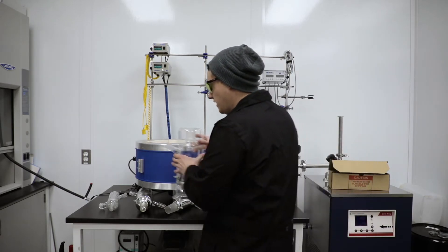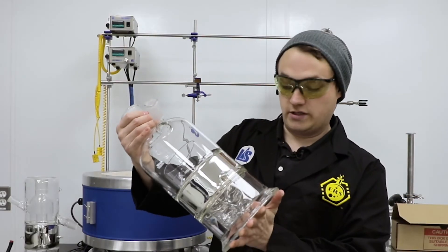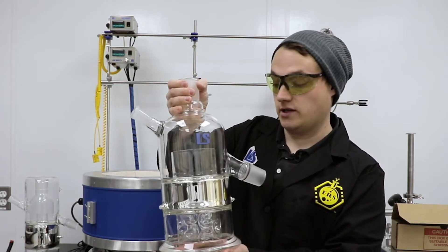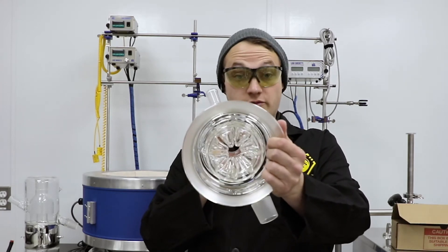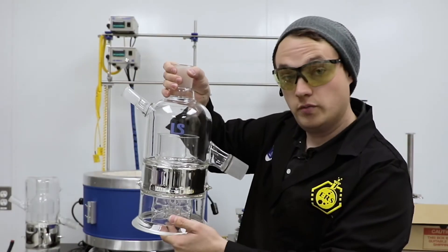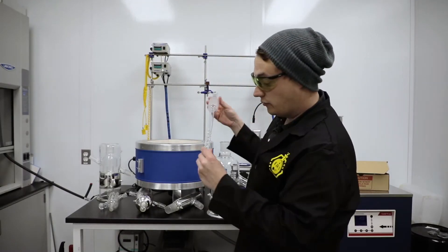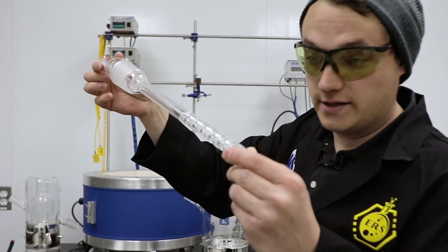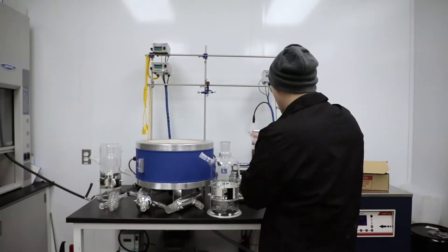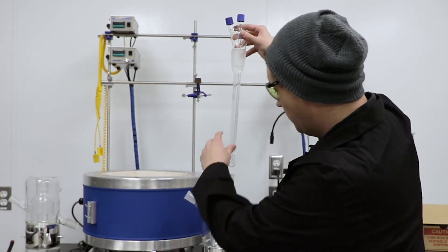From all of this knowledge and testing acquired from testing that distillation head, we created this distillation head, which is a 150 millimeter head. This was able to be included in our utility patent, which we have on all of these high-efficiency distillation heads. This one has a 120 millimeter up-tube and a 150 millimeter flange — so it's approximately a five-inch tube with large Vigreux indents. We have a large Vigreux indent insert with vacuum pulled on it, which works quite well on this head. And then we also have a liquid-cooled finger, which could be heated or cooled depending on what you're trying to separate, and this one goes right down the center as well.